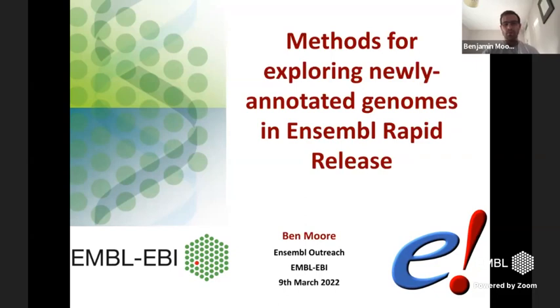My name is Ben Moore and I am the Ensembl Outreach Project Manager. So I'm in charge of delivering all of the events that are teaching people about how to use the Ensembl genome browser, exploring all the data we have and using it in their research. So today we just have a short webinar where I want to talk to you about how you can use the Ensembl Rapid Release website to explore newly annotated genomes.